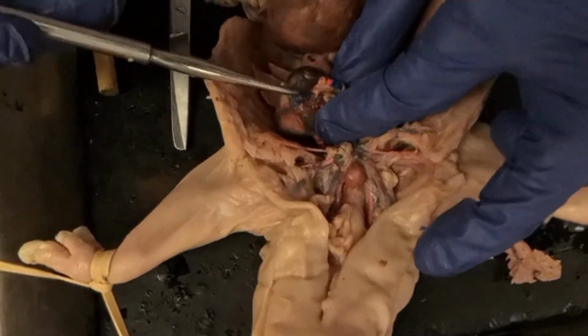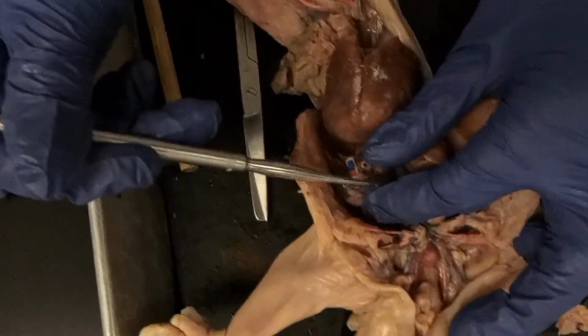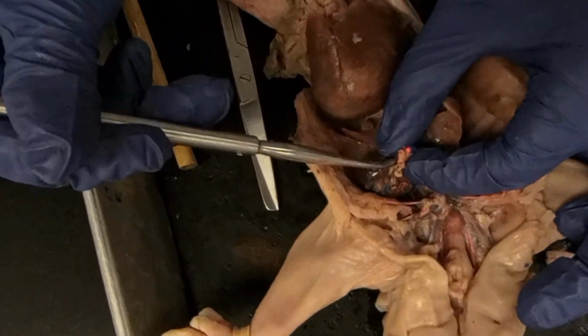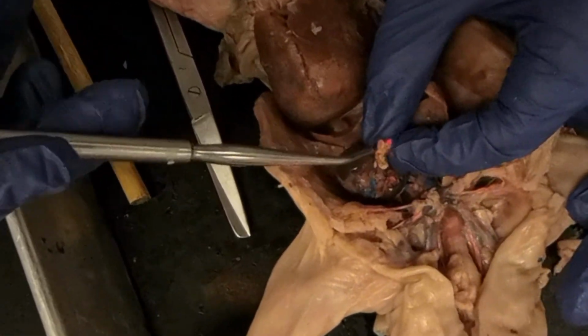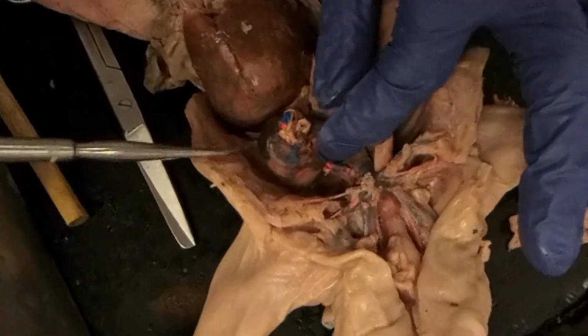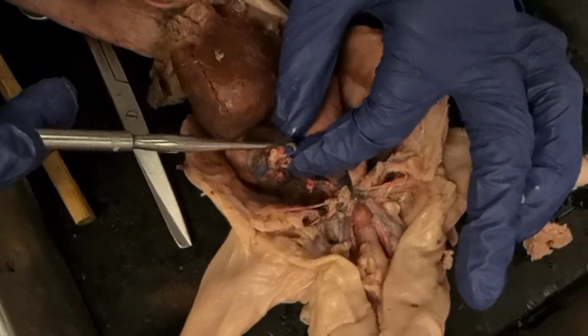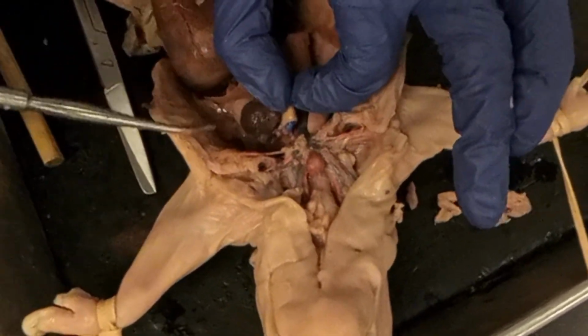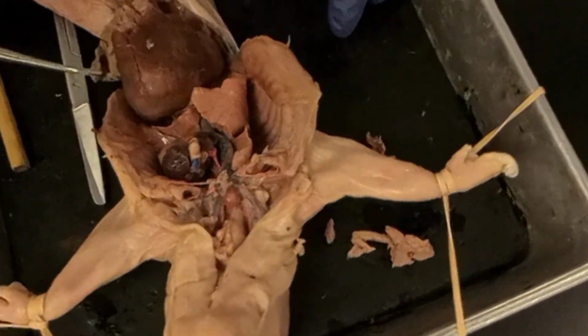And you can kind of see, oh my god, what's it called? The aortic arch. You can see where it kind of got cut, but you can see the different spots where it goes out into the rest of the body, like here, up here, and here. You can see right here, here, and here where it connected to go up there.